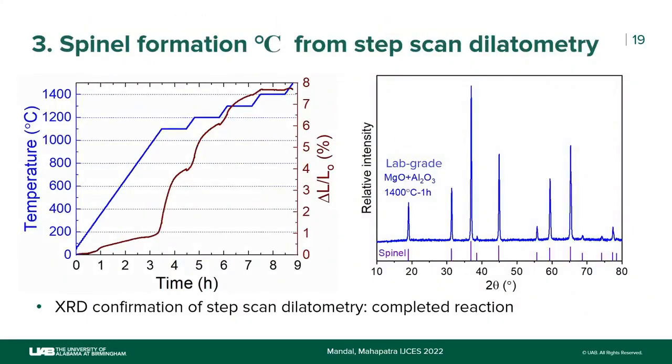And then we have confirmed this. We took this powder at 1400 degrees C for 1 hour, and we did XRD, and we saw that it is single phase spinel without any unreacted magnesia or unreacted alumina in it.